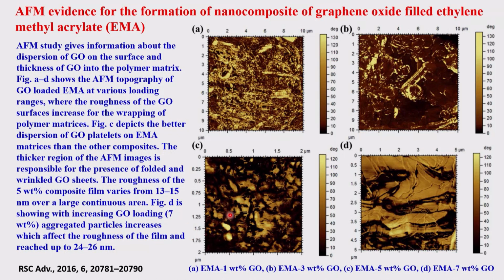Below that the distributions are not even, the distribution is not sufficient, and the roughness parameters are different, and therefore you have not so much use. So you can select the samples which are good for further studies, and then you can make a backward comparison between the property you're measuring and the surface structures.